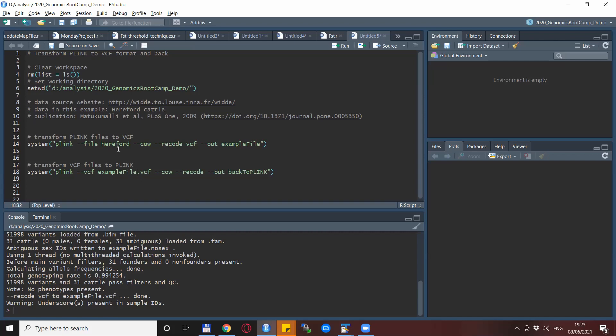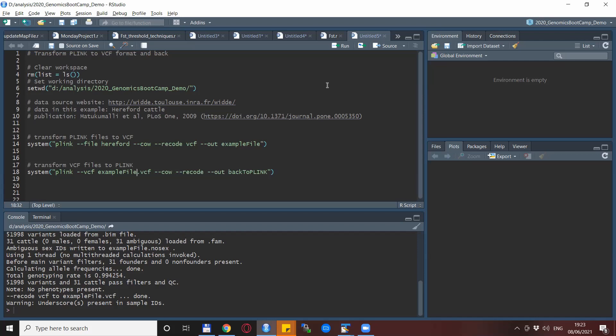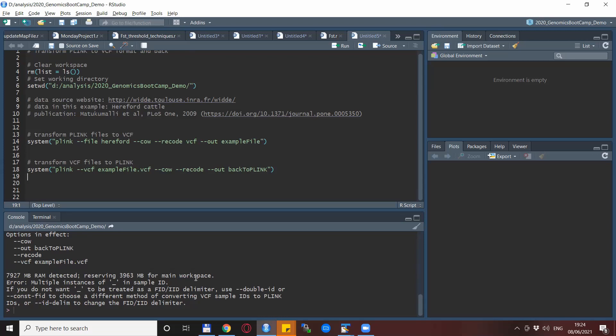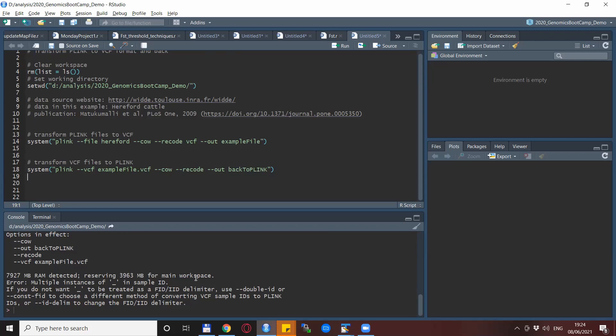So it has to be in our case example file dot VCF. While the dash-dash file does not require the dot ped and dot map file extensions, the dash-dash VCF does require the dot VCF file extension. We want to create ped and map files, so we just use the plain dash-dash recode statement. But after we run this we run into this error. It says multiple instances of underscore in a sample ID.